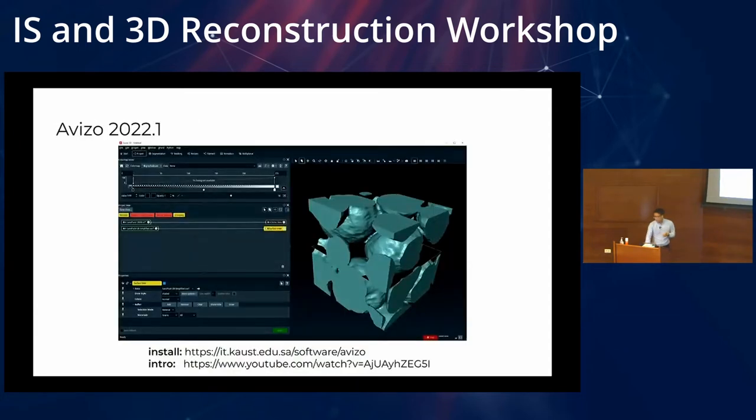For the first part, I'm going to be using Avizo 2022.1. If you have an earlier version, that's also fine. Does everyone have it installed and running? Can you raise your hand maybe if you have it running at least? Okay, that's fine. If you need help running it or installing it or whatnot, we have Tom and James in the background.